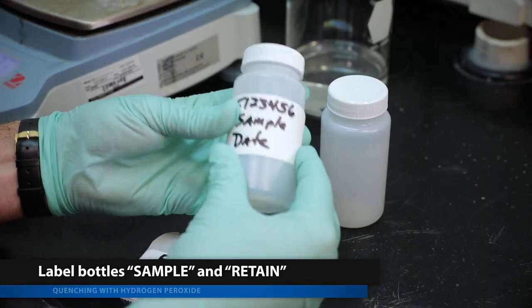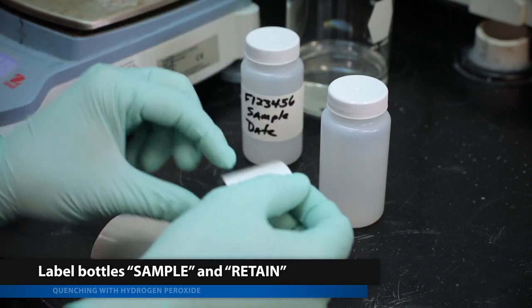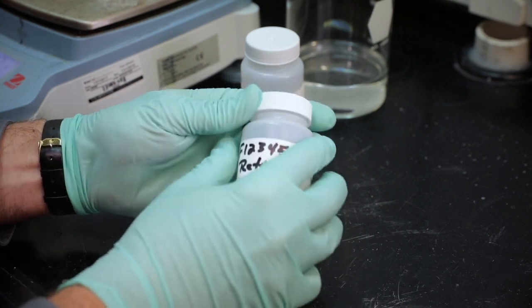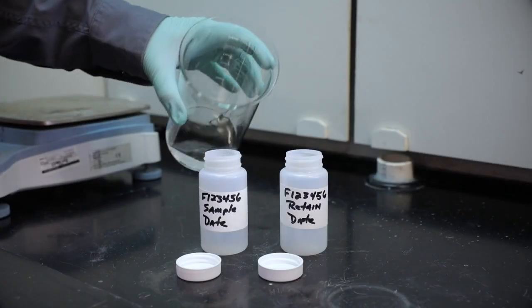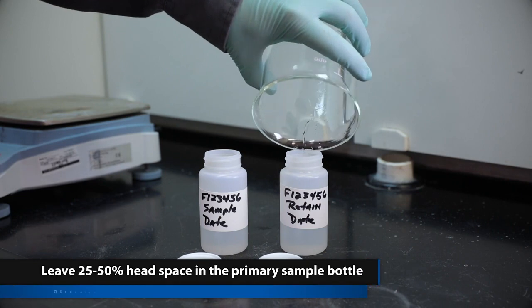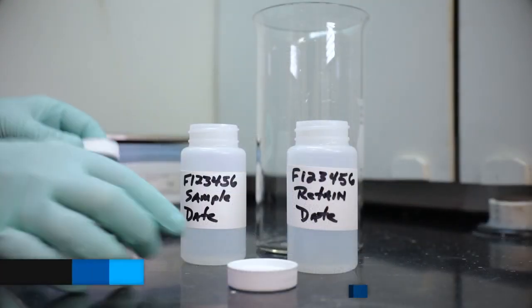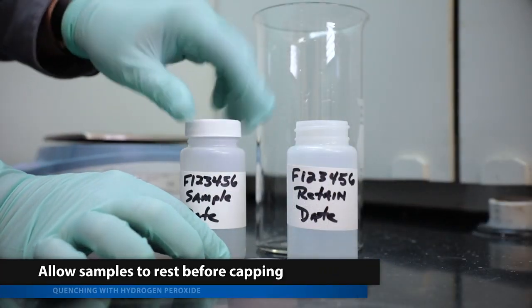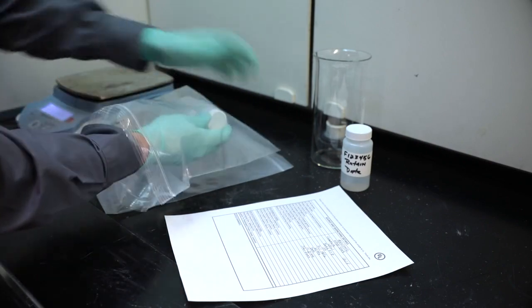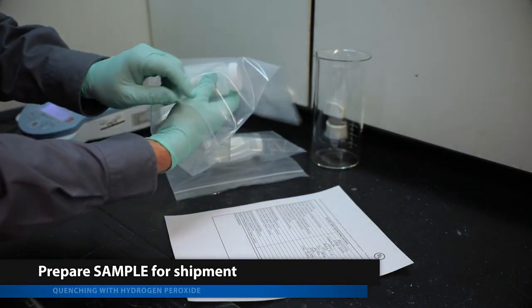Label two sample bottles using the sample identifier provided. Label one of the sample bottles as a retain. Carefully transfer approximately half of the sample to the primary sample bottle and the other half to the retained bottle. Ensure a headspace of 25 to 50% in the sample bottle. Allow the samples to rest before capping. Place the bottles individually into separate leak-proof sealed bags and prepare the primary sample for shipment.